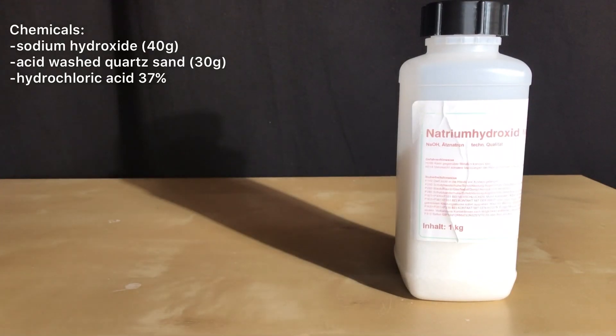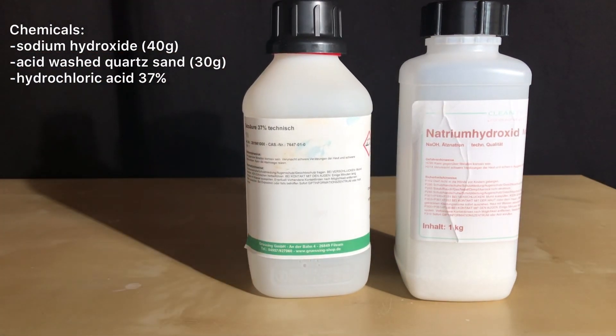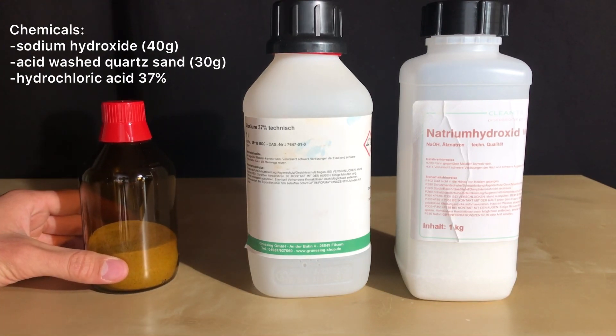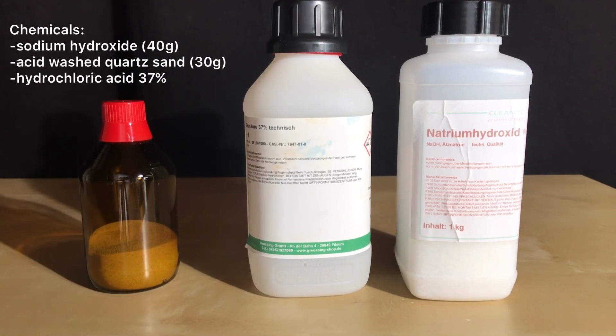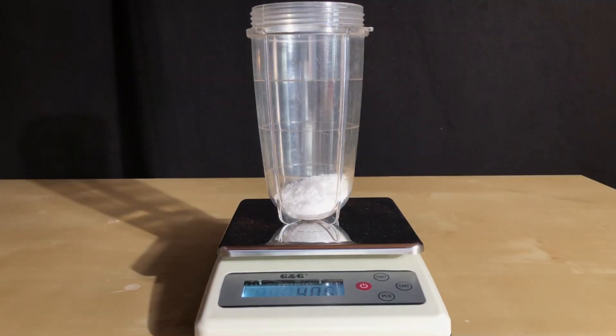Welcome back everyone. For today's preparation: 40 grams of sodium hydroxide, 30 grams of acid-washed quartz sand, and hydrochloric acid — we used 37% hydrochloric acid. We then started off by weighing out the sodium hydroxide.